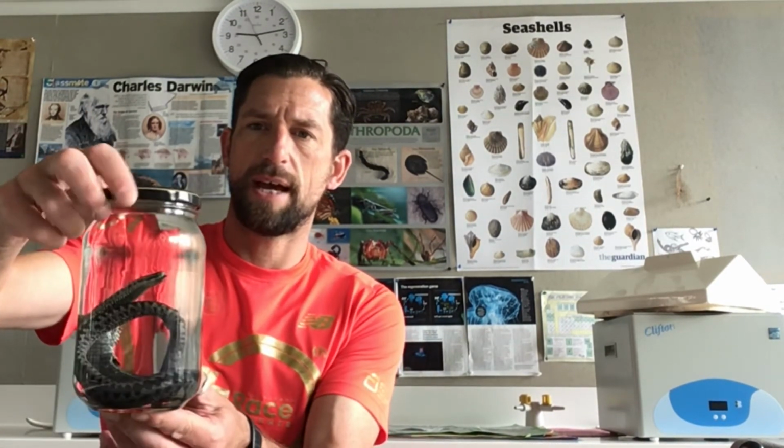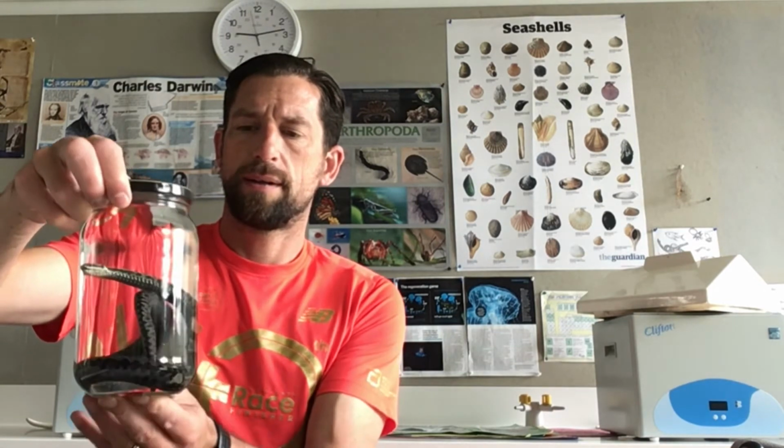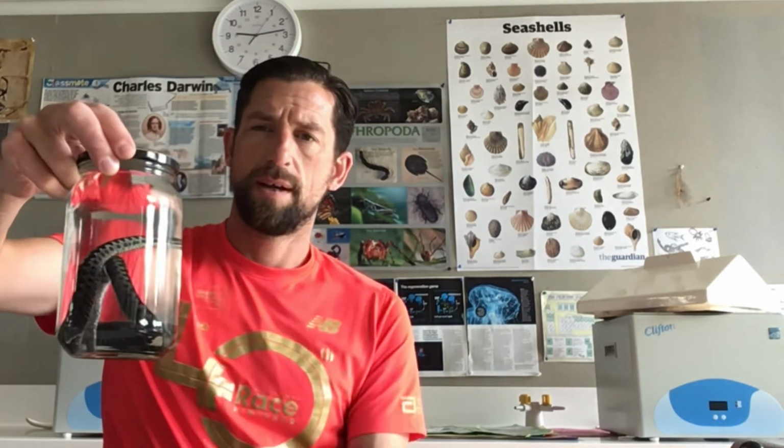And as I say, it's turned out well. I'm glad that I didn't get any air into the snake. I weighted it down actually with a pestle. Is it pestle, the long bit out of a pestle and mortar? Yeah, the mortar's the bowl, isn't it? I weighted it down with a ceramic pestle, which held it down, making sure that I got all the air out so that it will sit nicely in the jar, and tried to adjust the position so that you could see the head well. It's sitting quite nicely in there as a nice wet specimen. I've sealed the lid very tightly, and that will last, as I say, indefinitely. So pretty pleased with how that turned out as my first wet specimen.